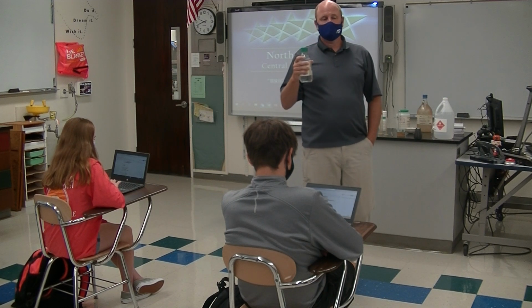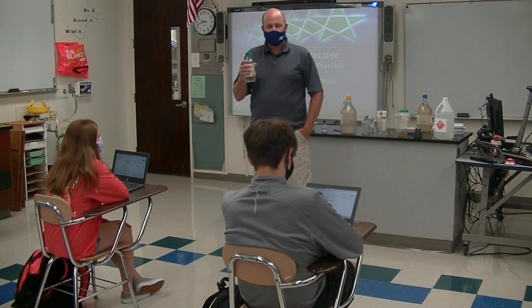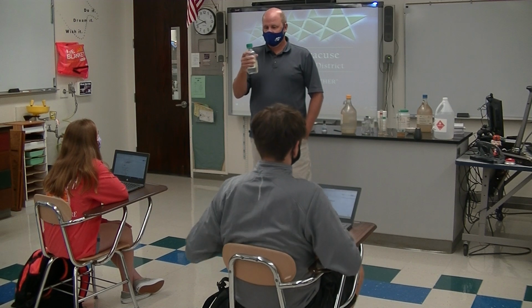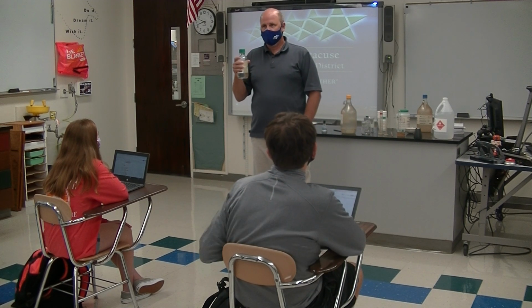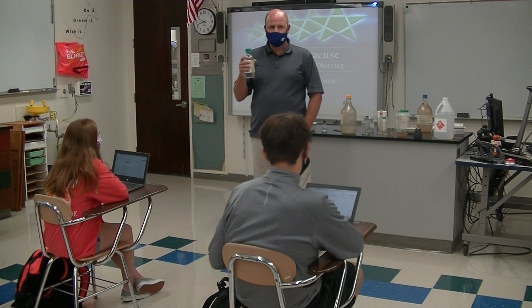There's going to be times throughout this year that you're going to have to identify things by the smell. How do you smell things? You guys have never smelled things in a science class before. Have you ever heard of the term waft? You have. That's the only place you'd ever hear it.